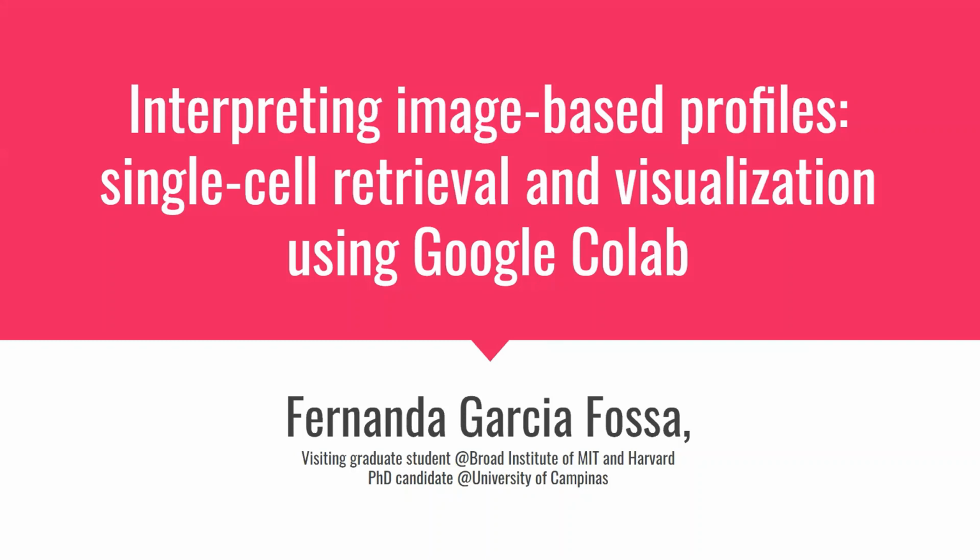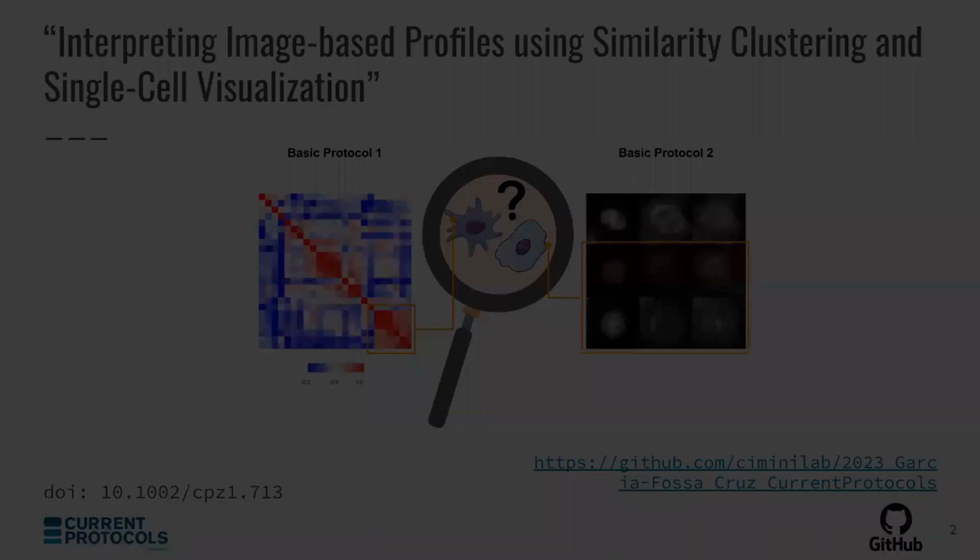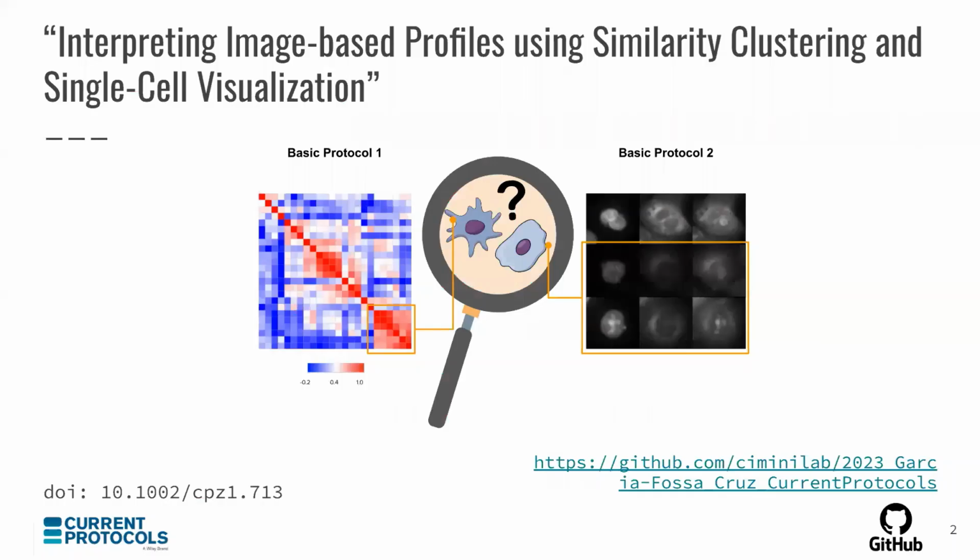Hello, I am Fernanda, and today I'm here to present how to interpret image-based profiles using single-cell retrieval and single-cell visualization through Google Colab. In this presentation, we are covering this paper that we published recently, called Interpreting Image-Based Profiles using Similarity Clustering and Single-Cell Visualization.